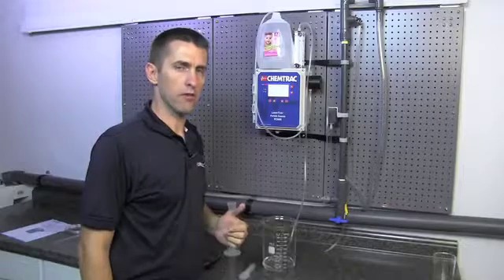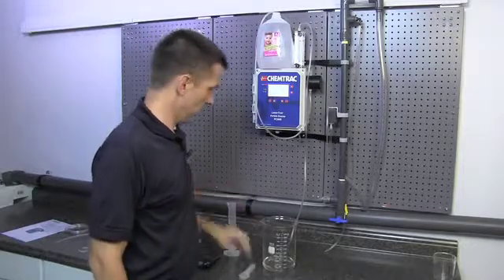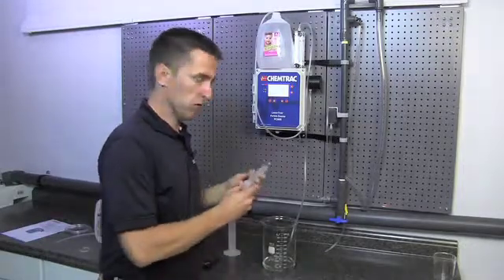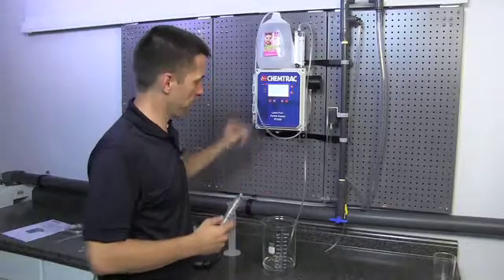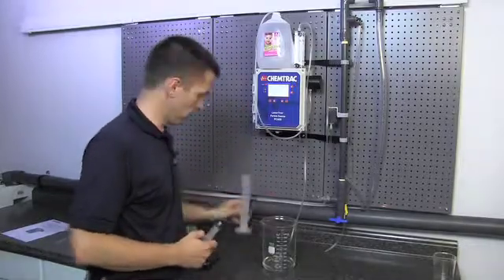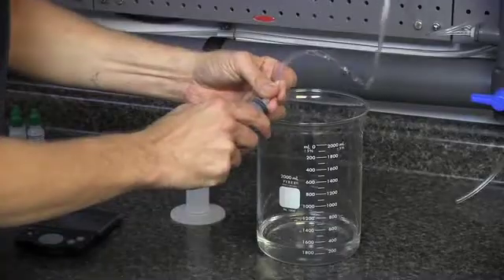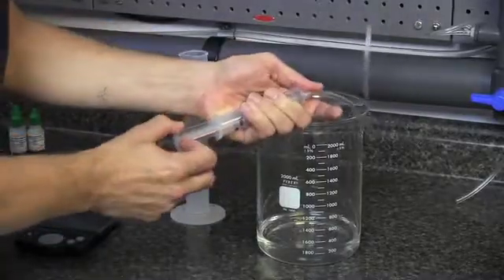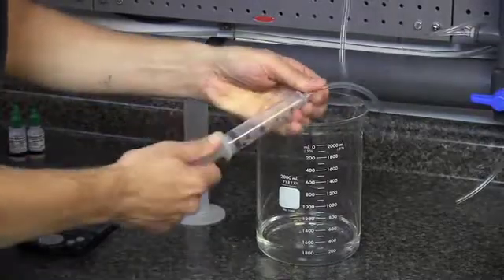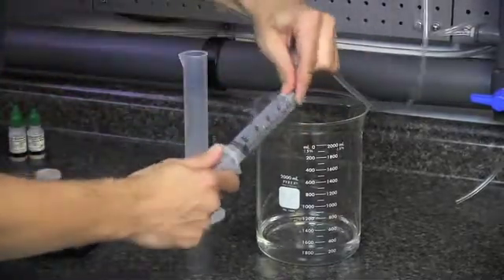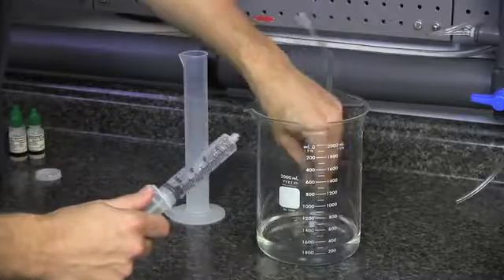Once we have this all set up, the next thing we need to do is calibrate the flow meter. We're going to need a syringe to start the flow through the sensor and through the flow meter. We'll also need our graduate cylinder and a stopwatch. We're just going to attach the syringe and just use this to draw water through the sensor and place the tubing back into the jug.